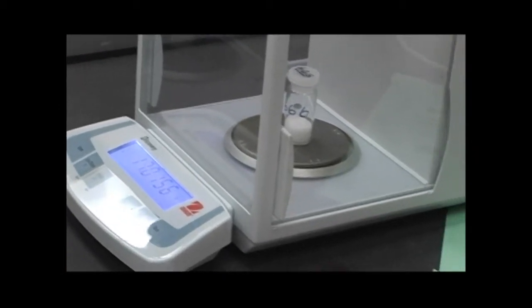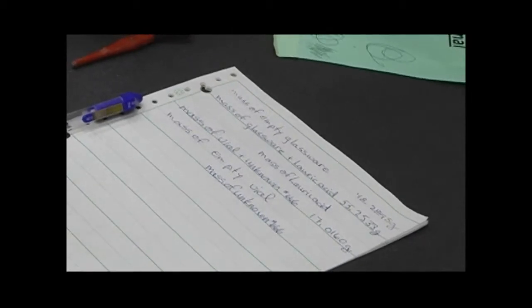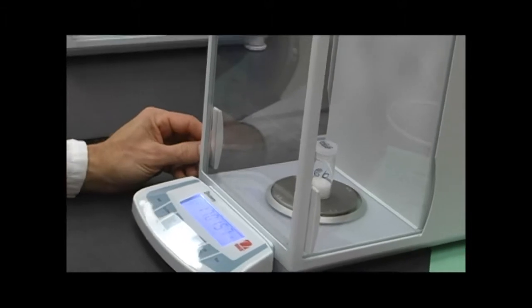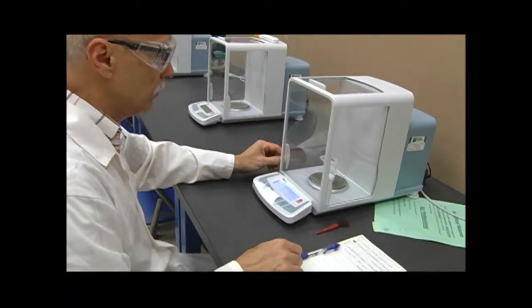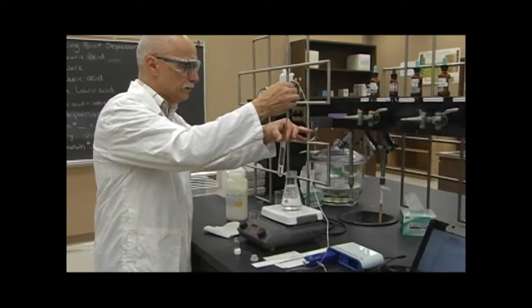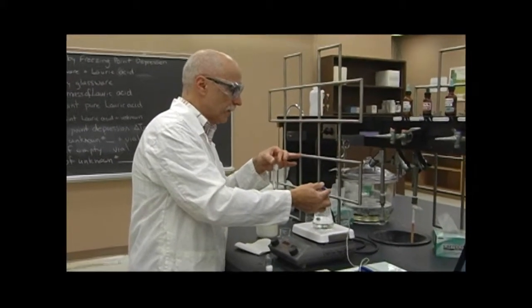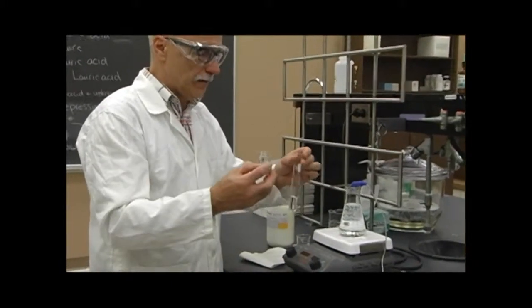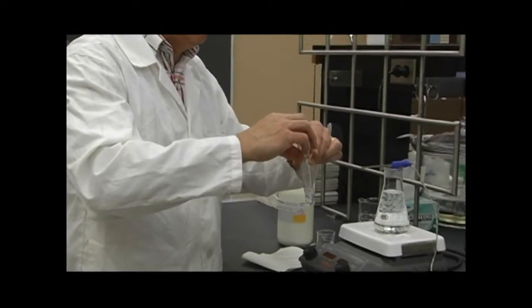And now we'll return to the lab, empty the vial into the liquid pure lauric acid, and then come back and mass the empty vial to determine how much unknown we've put into the solvent. Go again. So we have the lauric acid that's been melted, and we have our unknown. Do your best. It's got to be an easy way.